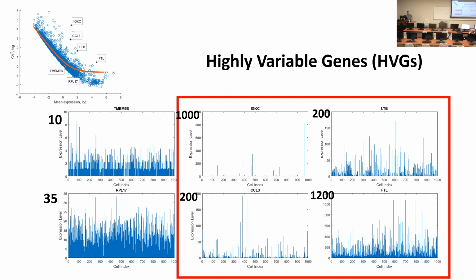Maybe we can ignore that. We don't have to do DE analysis. It doesn't make sense for the single cell data. So for instance, in this case, how can you compare this gene with that gene? It looks like the expression level.